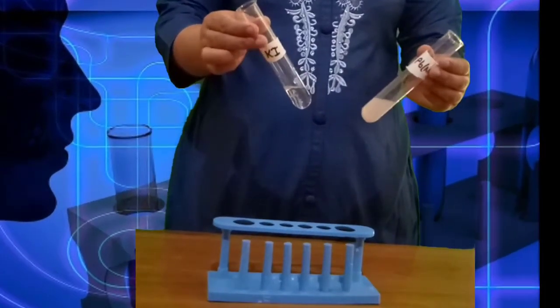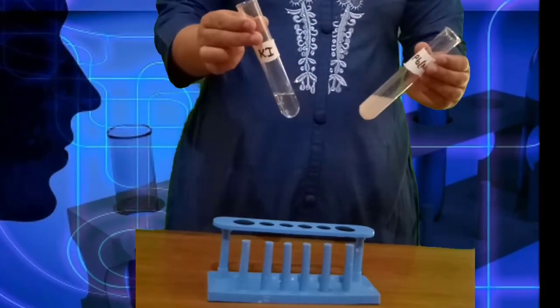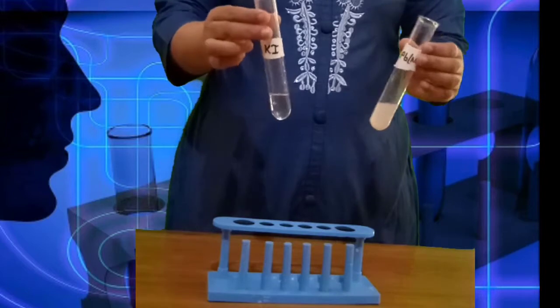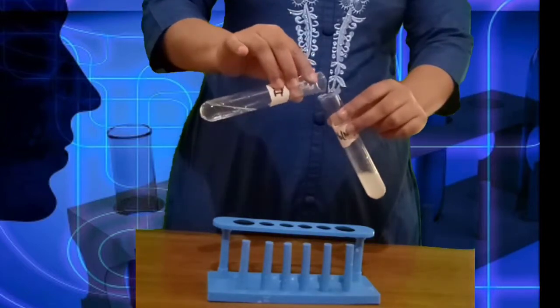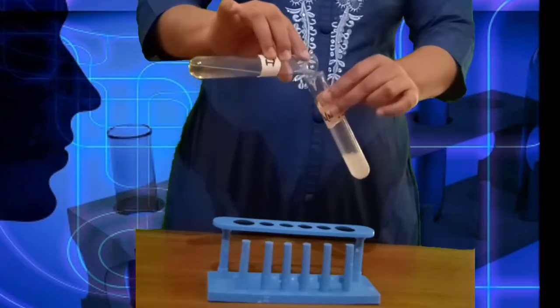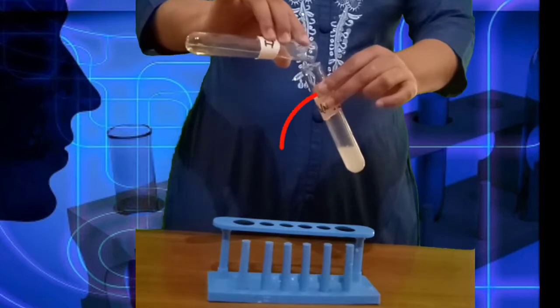Procedure: Prepare the aqueous solution of lead nitrate and potassium iodide. Here both the solutions are transparent. Now mix them and observe.